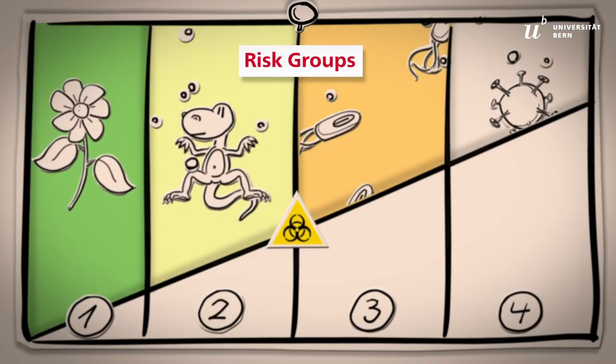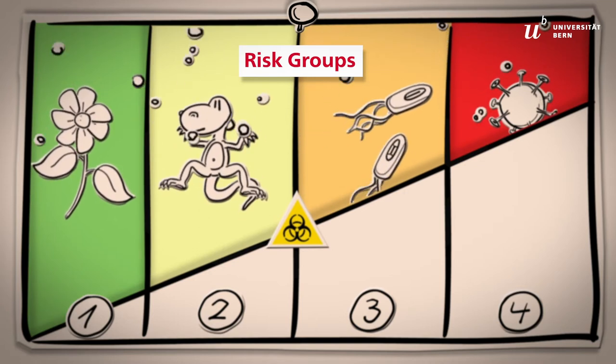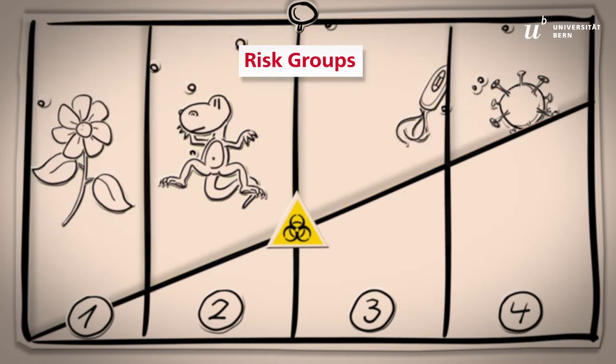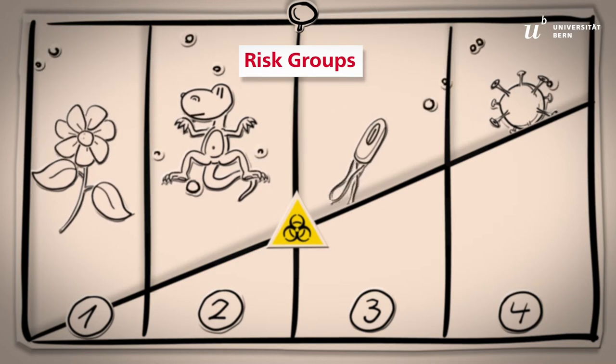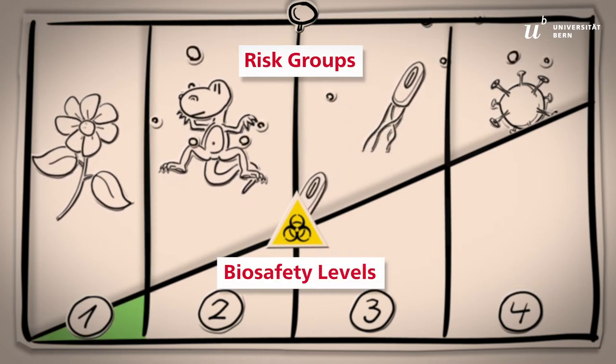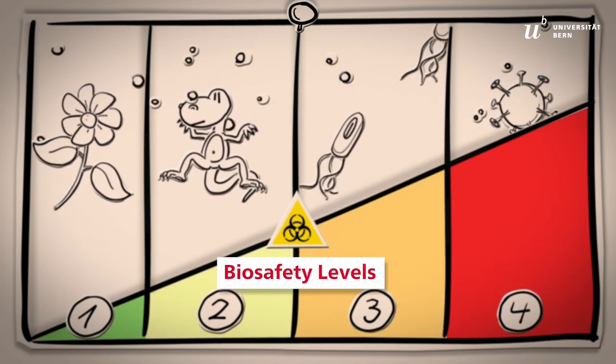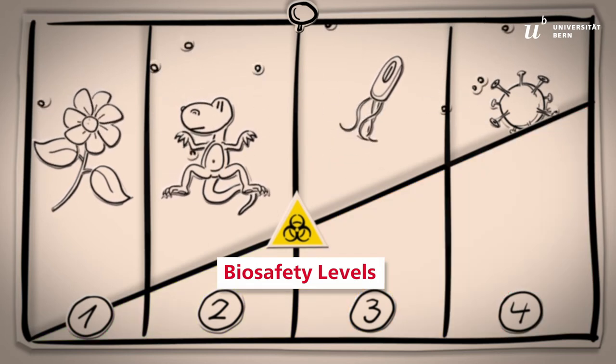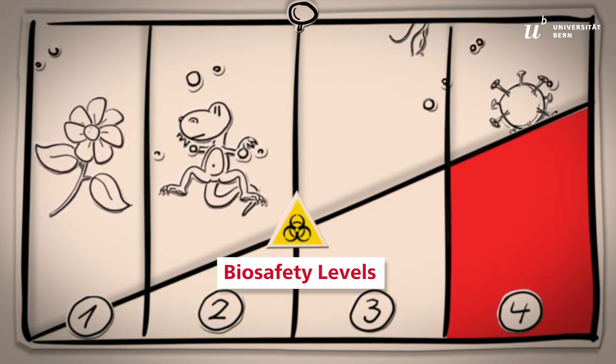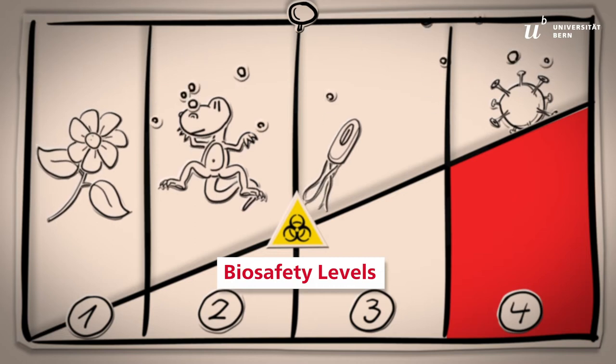Organisms are assigned to one of four risk groups based on their characteristics. A risk assessment of activities with these organisms determines the biosafety level for the laboratory. Biosafety level 4 requires the highest containment standards and safety measures.